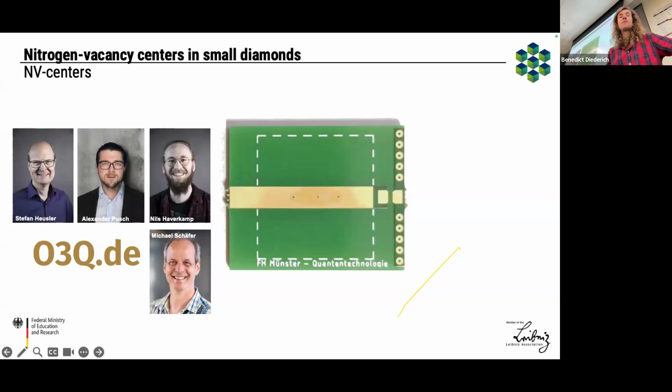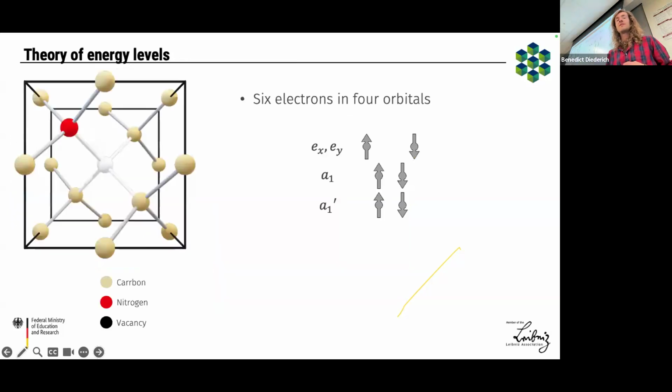And so what this is, it's a PCB where you see the little dots here, and these little dots are basically diamonds. These diamonds are crazy fluorescent particles. With a confocal microscope, you can measure the fluorescence. That's one cool thing. And if you apply a microwave on this little strip here, which is basically an antenna, then you can bring these diamonds, which are very funky NV centers if you dope them.